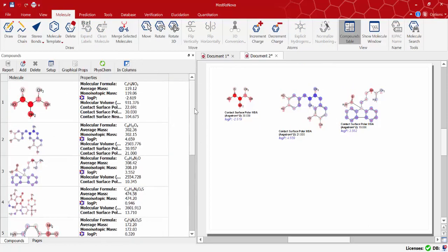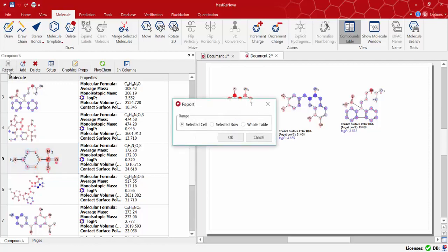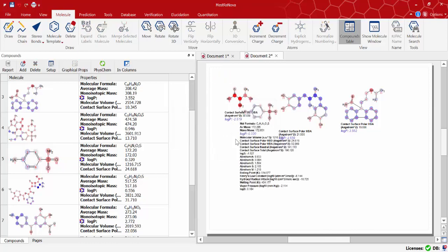If you want to report all the properties for a particular molecule of the batch, highlight it, click report and click on selected row. If you just highlight a molecule you will just get the report on that selected property.